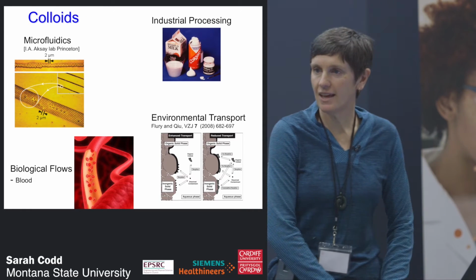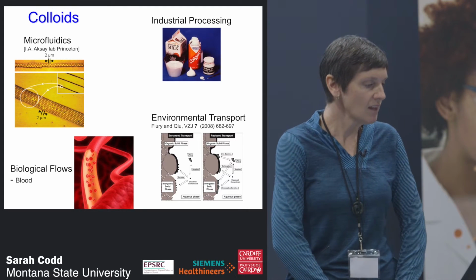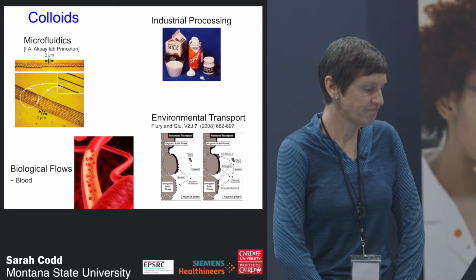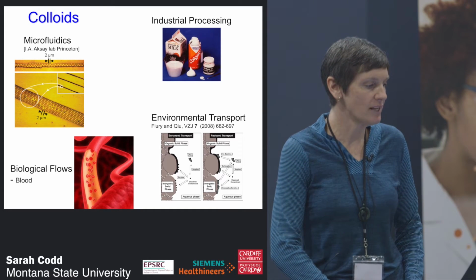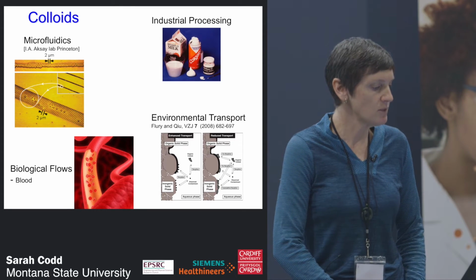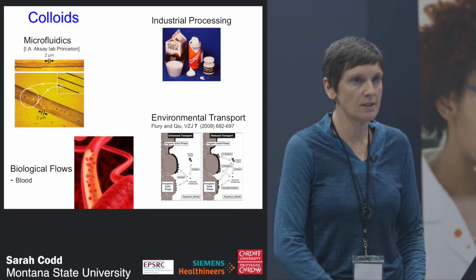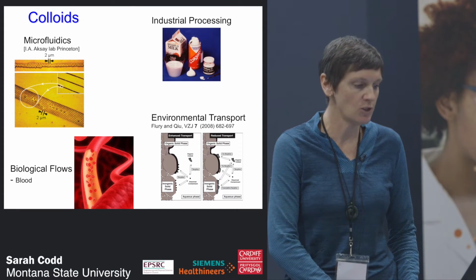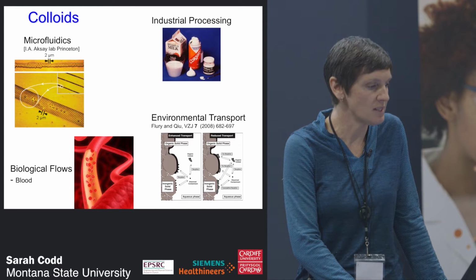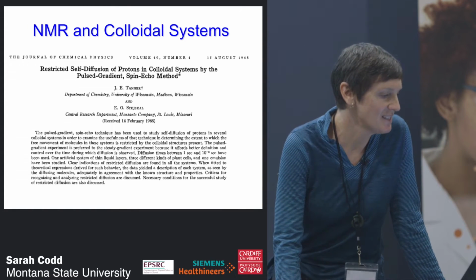So the second application that I want to share with you today is the idea of being able to measure colloidal particle motion. Of course, colloidal particles are really important as we think about industrial processing of emulsions, and also of biological systems where we have blood flow, and then of course contaminant issues in environmental situations is a really important application of colloidal transport. We weren't the first people to look at colloidal transport by any means.